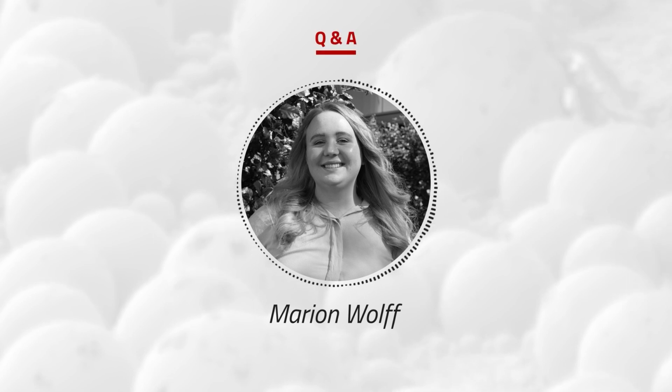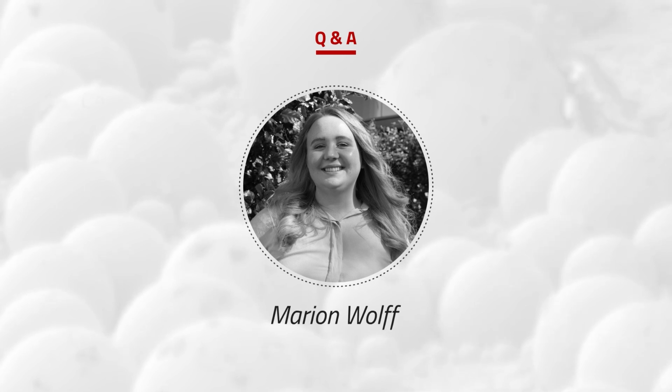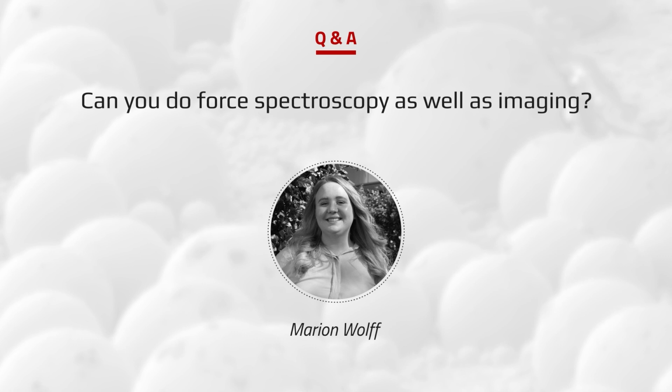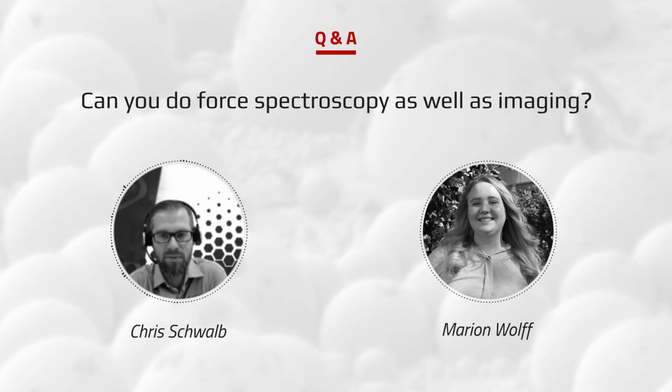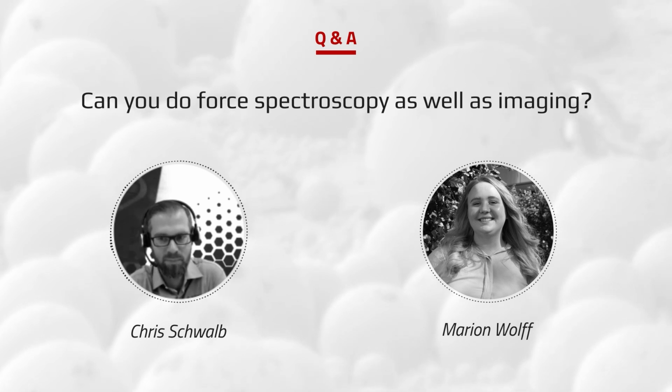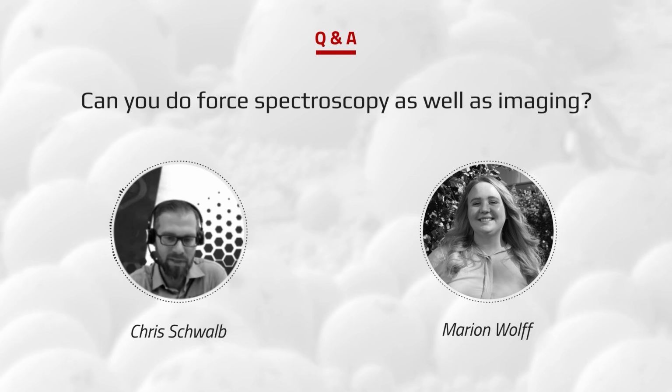I think we already have the first question for our second question and answer session. Can you do force spectroscopy as well as imaging? Yes, we can do both force spectroscopy and force imaging. This is also implemented in the FusionScope software. And then, like Lucas already showed, you can export the data into any file format that you would like to use. So this is something we can do with the FusionScope to measure mechanical properties.